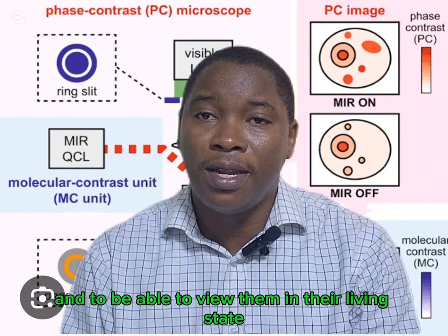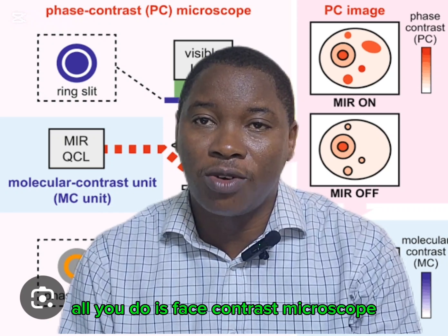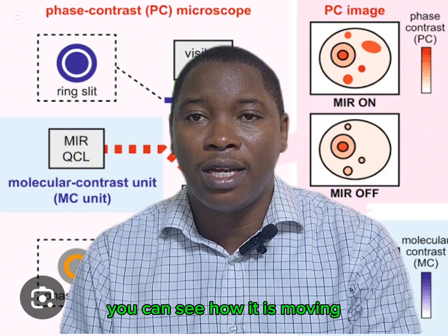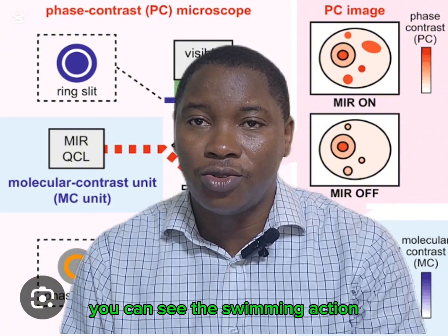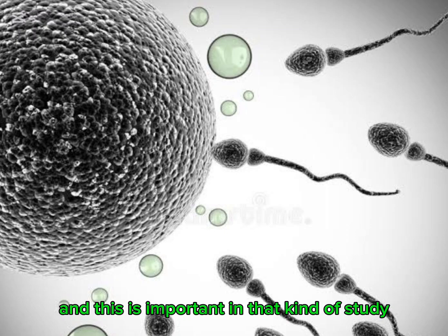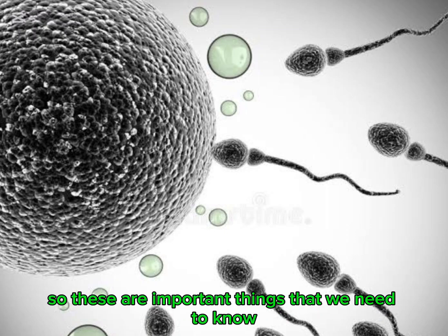And to be able to view them in their living state, what you do is phase contrast microscopy, so that you can view them, you can see the tail of the sperm cell, you can see how it is moving, you can see the swimming action, and this is important in that kind of study. So these are important things that we need to know.